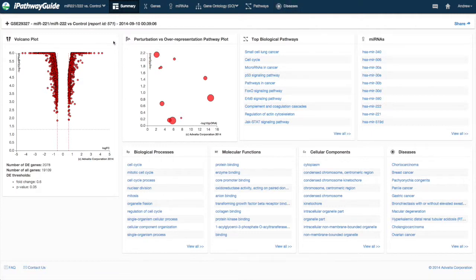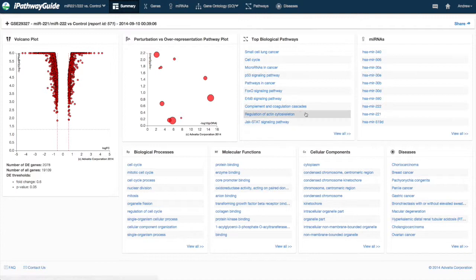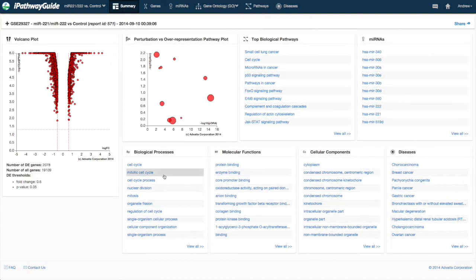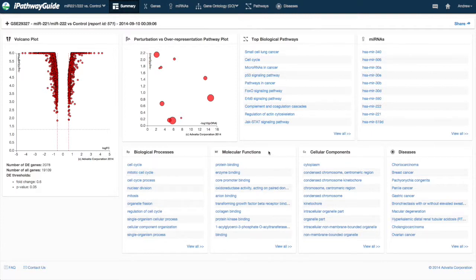The summary page is broken into five main sections: the volcano plot, top 10 pathways using impact analysis and the associated plot, top predicted microRNAs, top gene ontology analysis results for biological processes, molecular functions and cellular components, and top disease analysis results.